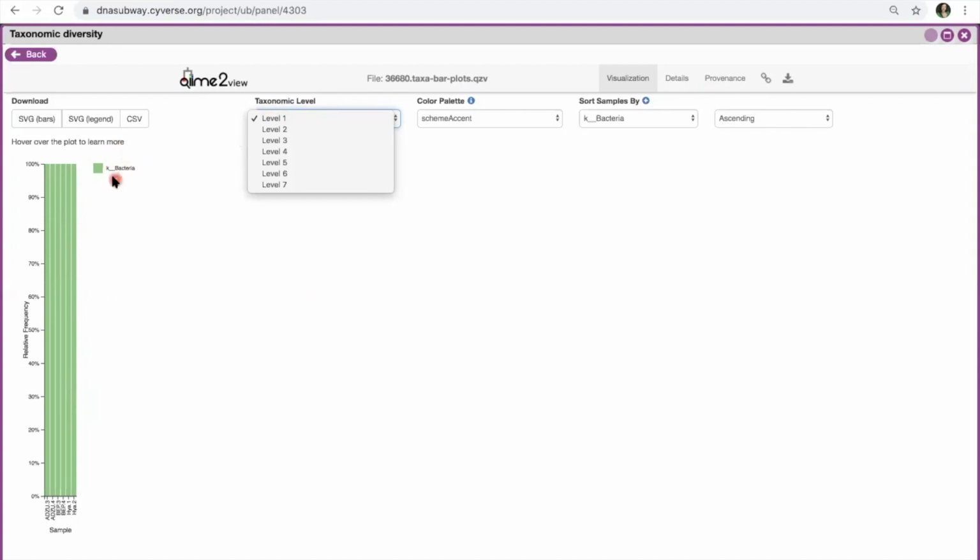that was sequenced, which is good. That's what we wanted. That's the primers that we chose. So that's exactly what we wanted. For your data, you may also see archaea here. That's fine because the primers that we chose, the 515, 806 primers, are also going to select for archaea. You might also see eukarya here.